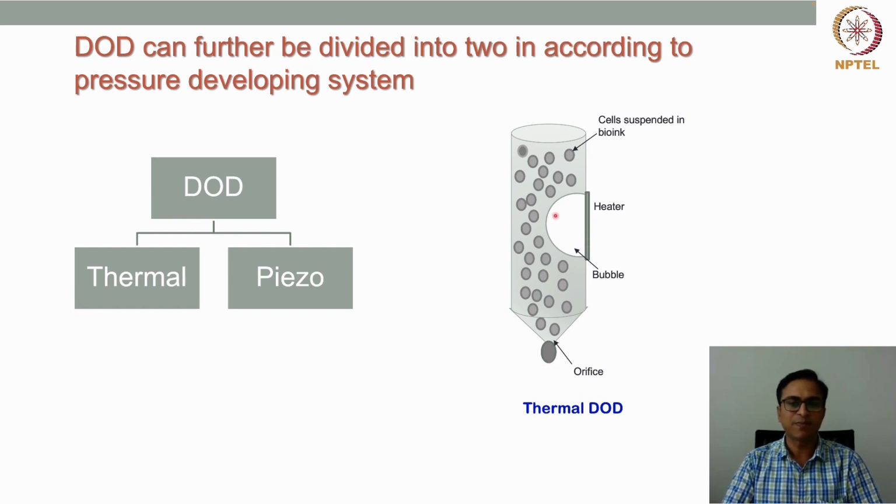Now depending on the frequency of this bubble production, the droplets will be produced one after another. To prevent the flow of this liquid backward, a neck kind of geometry is created toward the inlet side. So that's why the liquid cannot go back towards the inlet, but is pushed through the outlet, or the orifice, where the droplets are being created, right?